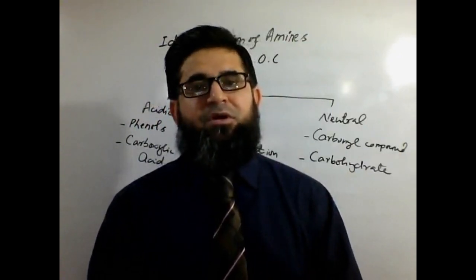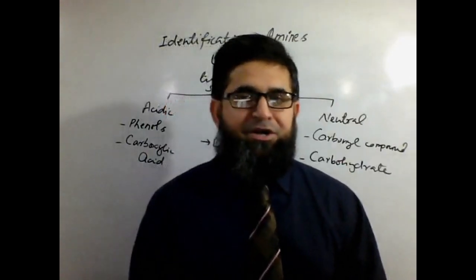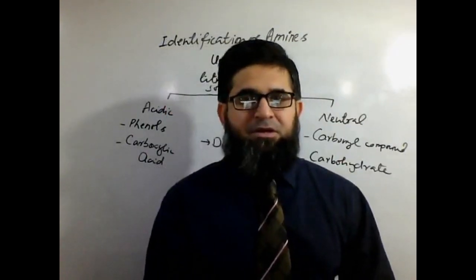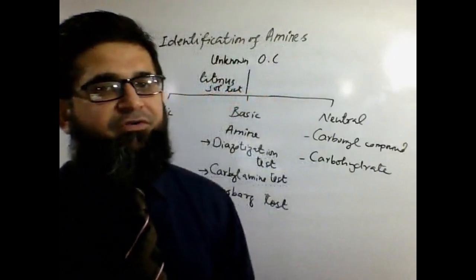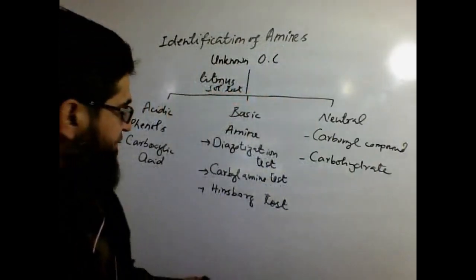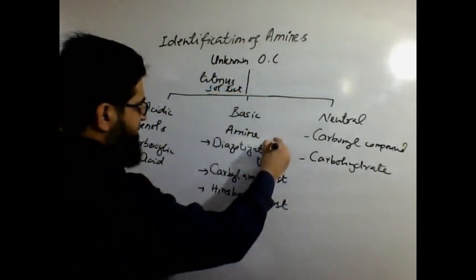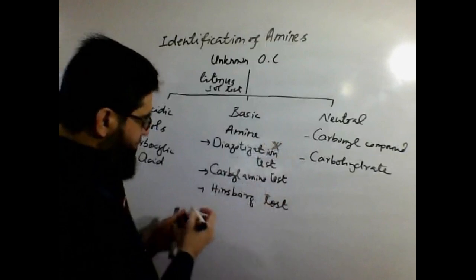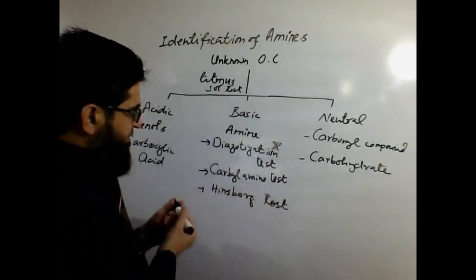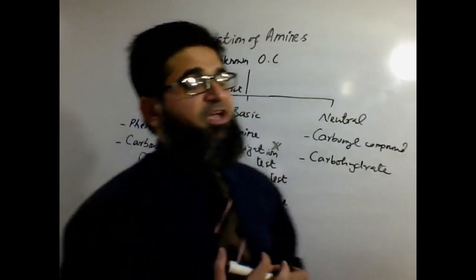Sometimes, if you are doing the identification of an amine and you find that ice is not available in the laboratory, then maybe the diazotization test will not be possible for you. You may go for the carbylamine test in order to confirm the presence of amines.